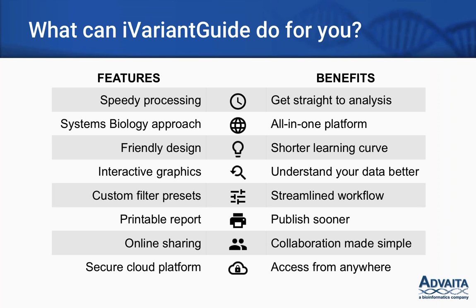In addition to our powerful functionalities, iVariantGuide has several features to enhance your experience. I'll just mention a couple. Our processing time is quick. It only takes a few minutes to fully annotate your data set, which means you can have answers within the hour.